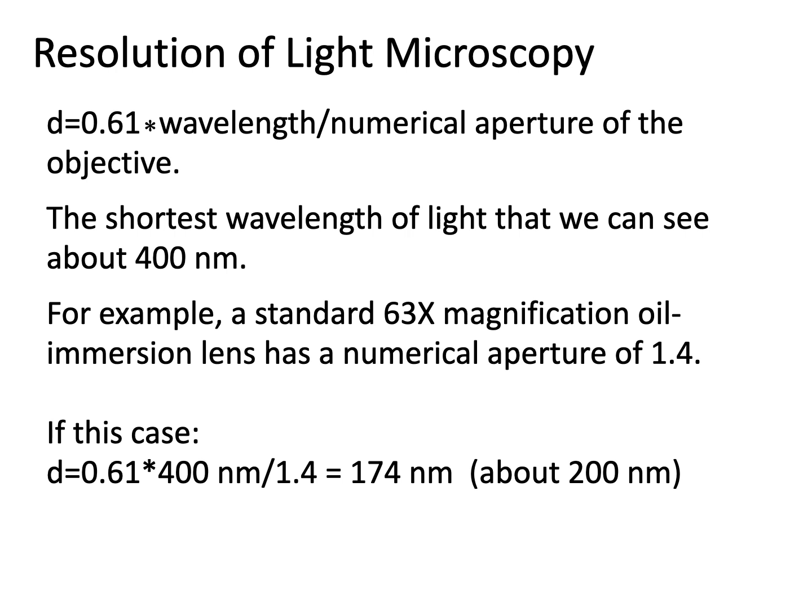So that's a good number that I just have in my mind. It's one of the numbers that I think is important enough that I'm sure I remember it. And it's 200 nanometers. That's about the typical limit of resolution of light microscopy, what it can resolve.